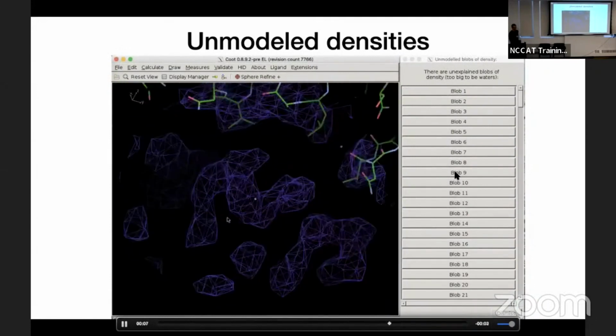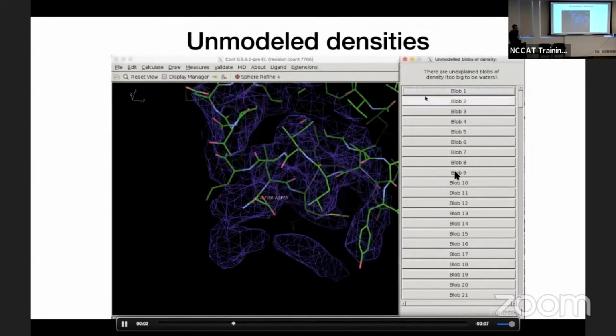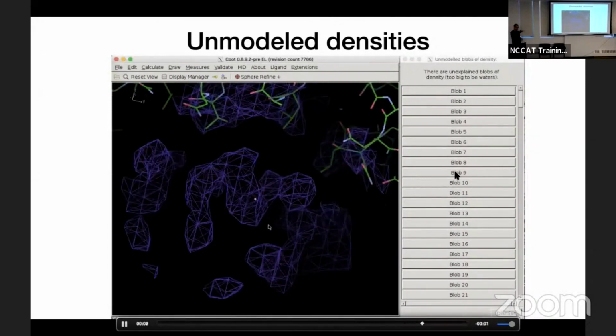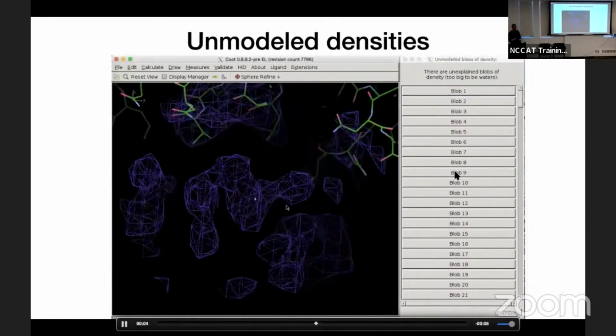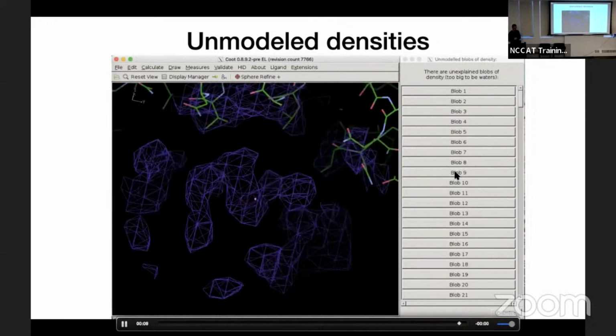Maybe it's the ligand that you were hoping to see in your structure, or fairly often there may be some peptide. I've seen a few cases where your chain will disappear and you'll lose the density, but some of it may be ordered because it's packing up against another protein. So you might see a helix that you haven't modeled, which you can then account for in that way.